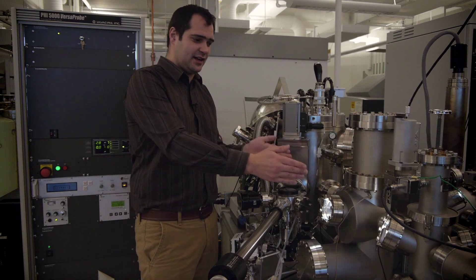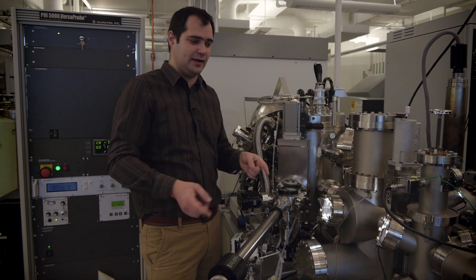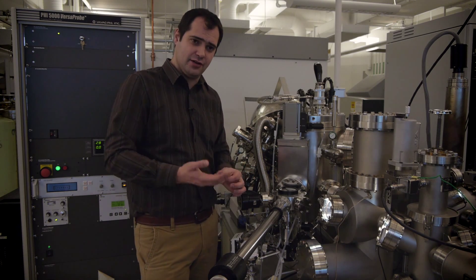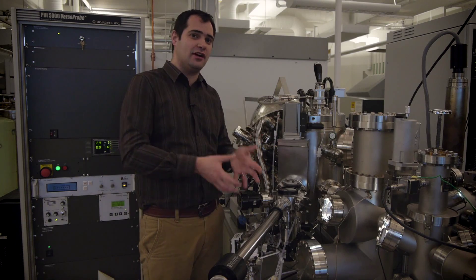We have a dedicated surface preparation chamber where we can clean our surfaces, because whenever we insert our samples into the chamber, they are going to be exposed to atmosphere. They will have hydroxyl or hydrocarbon species on the surface, and because we are surface sensitive, we will be measuring those rather than the solid itself.